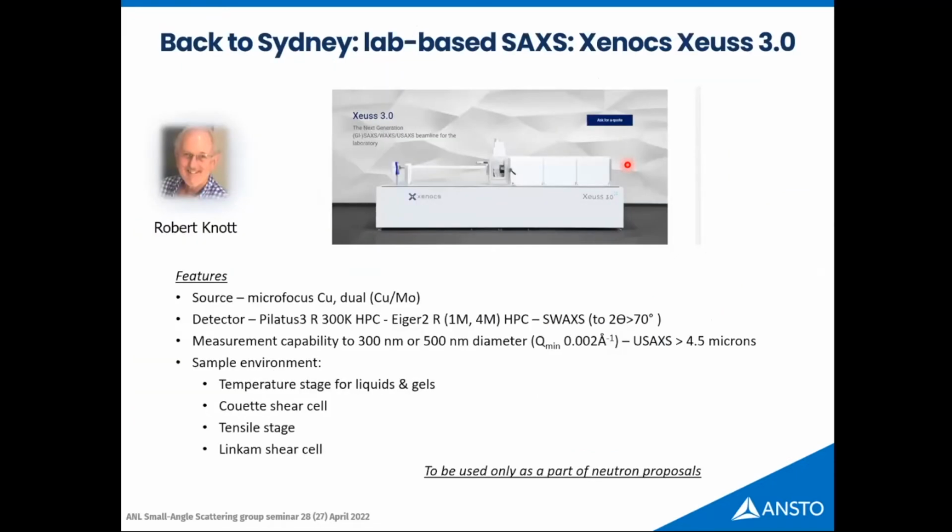As I mentioned, we have a little lab-based SAXS. This is a very new one. It was commissioned about 3 weeks ago, and it's waiting for its license to be used by users at our facility. It's literally sitting about 10 meters away from Bilby. As I've seen from training, this machine is really great. I know I'm praising things a lot, but I really like them. Robert Knott is in charge as instrument scientist of this little one.